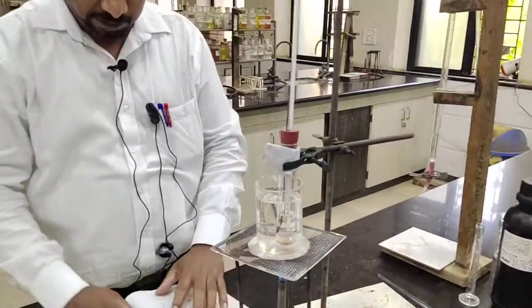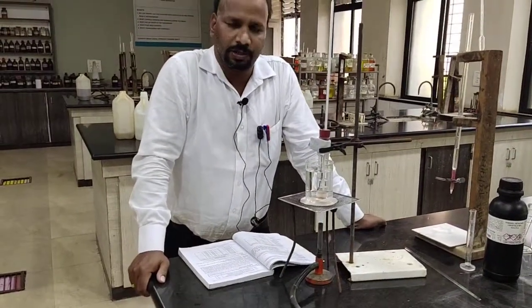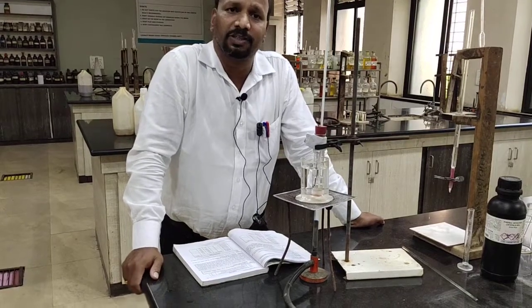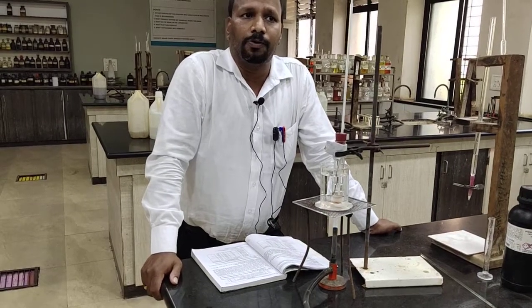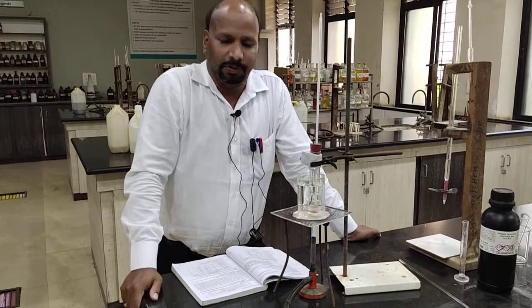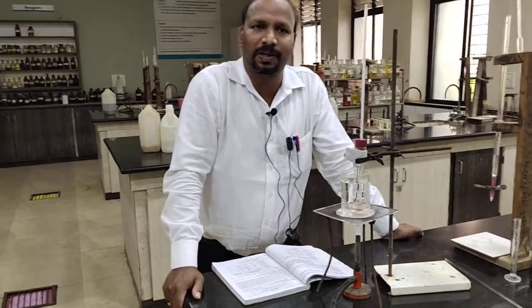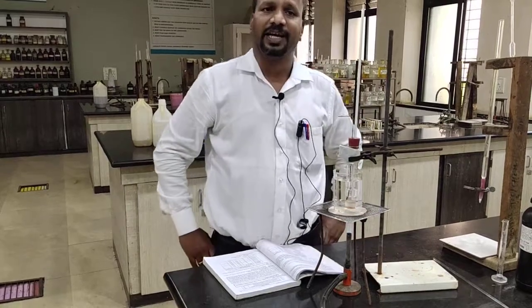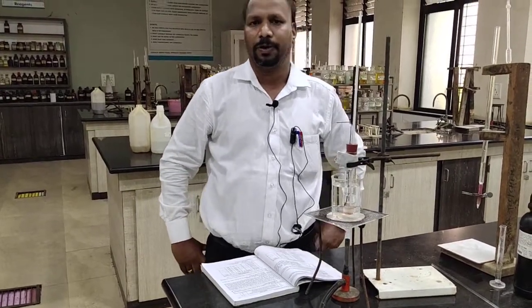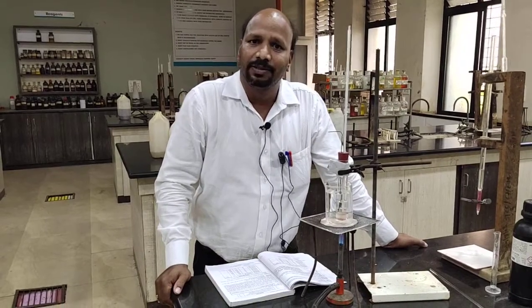Now, phenol we are not going to measure on a weighing box because we have to use it with special care. So we are going to use phenol as a liquid. We have to know the weight of phenol because we want to find out the percentage of phenol, so for that purpose we need the density of phenol. We have to take 10 gram of phenol, then 5 gram, then 2.5 gram for various percentages of phenol.